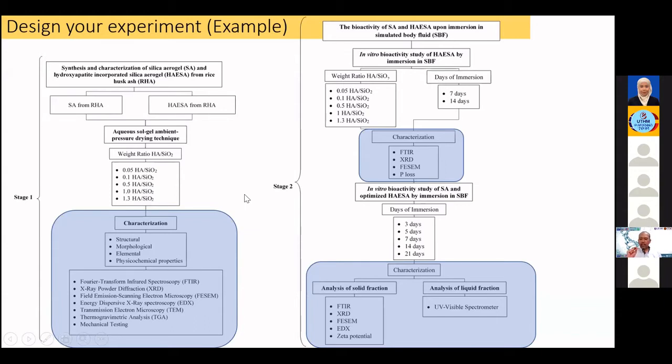But this characterization technique is not just applied for the synthesis, to know the material after synthesis, or to know the material after modification. It's not only there. You can actually design the experiment so that these characterization techniques can be used to analyze the sample after a certain application or after certain effects. Many things. I'll give you an example here.